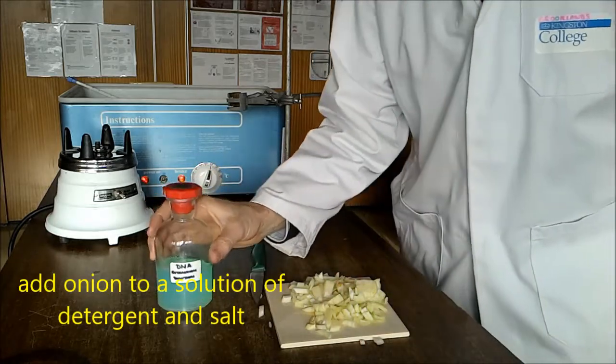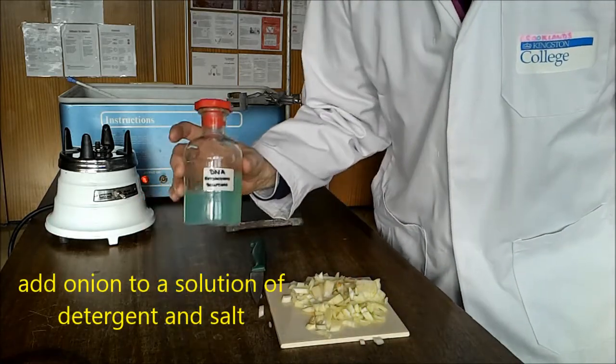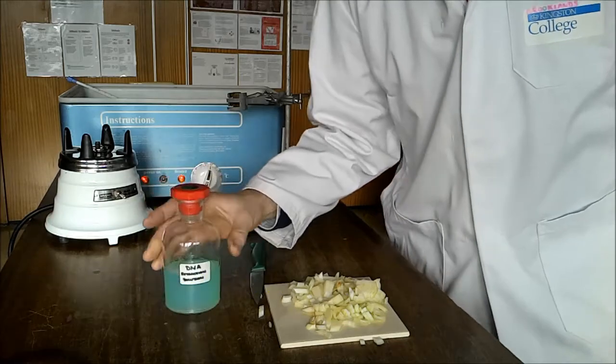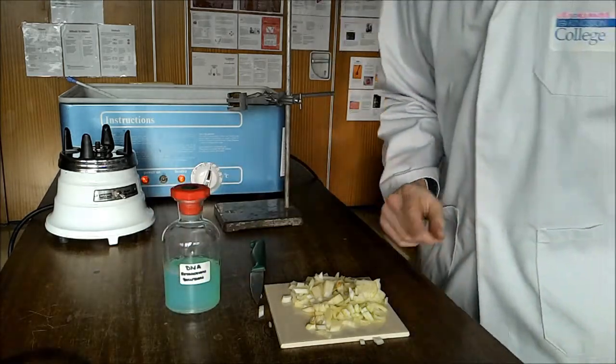We're going to put 100ml of the detergent and salt mixture onto the onion.